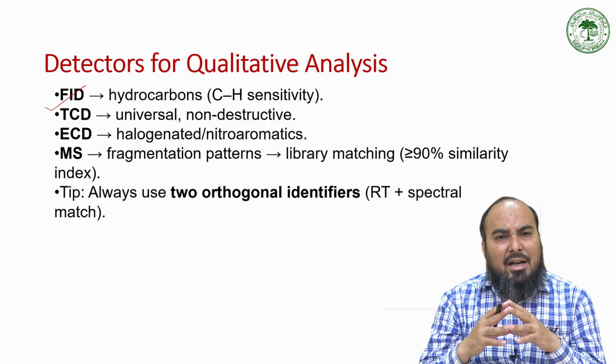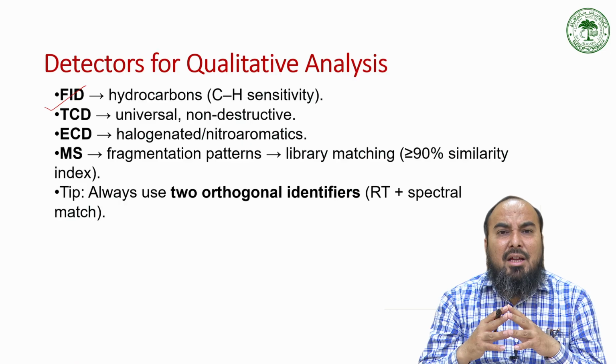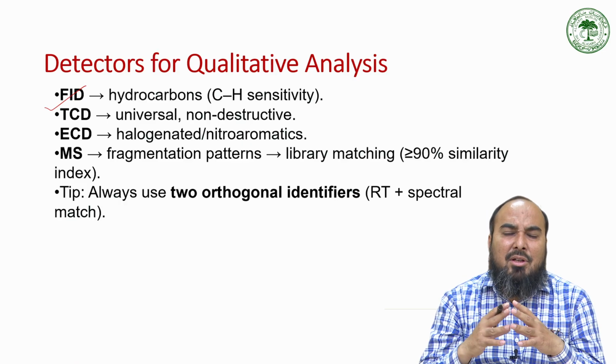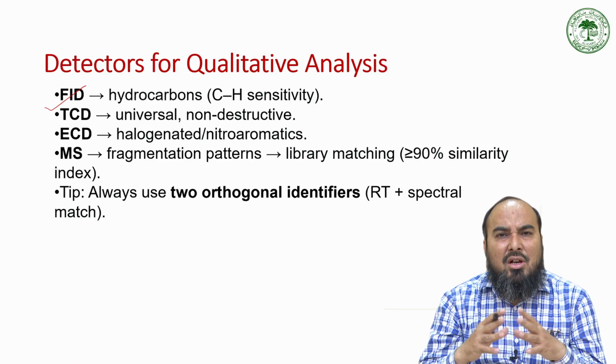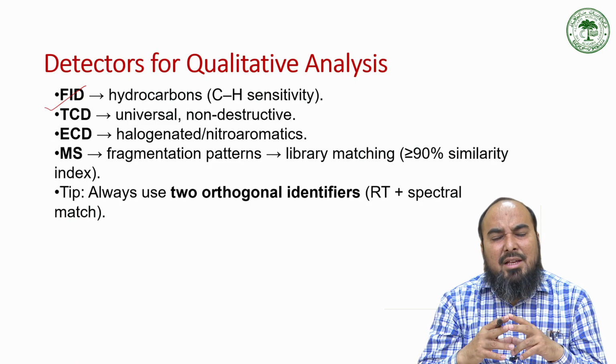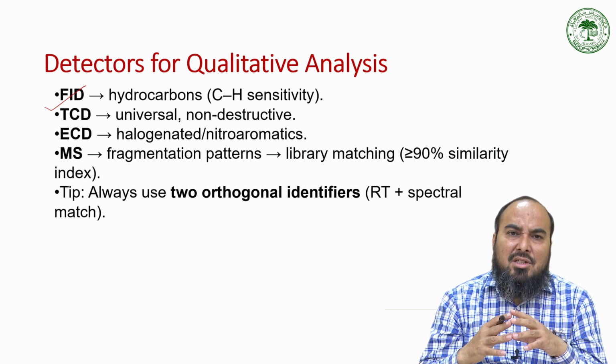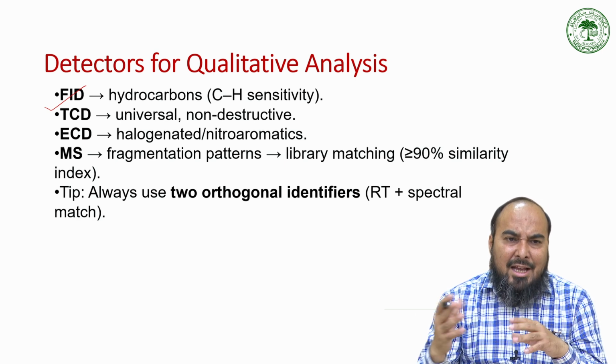The analysis for recording the sensitivity, where organic compounds are involved, because all organic compounds have a carbon backbone, and FID is actually based on the combustion of the carbon, which produces a signal that is actually proportional to the ions produced.